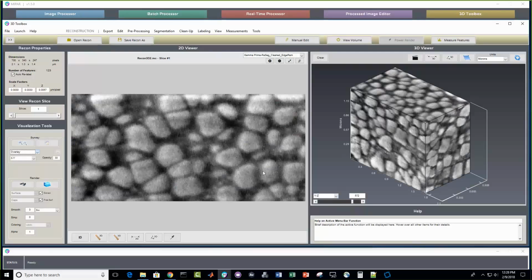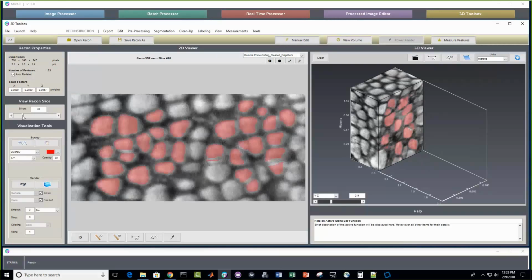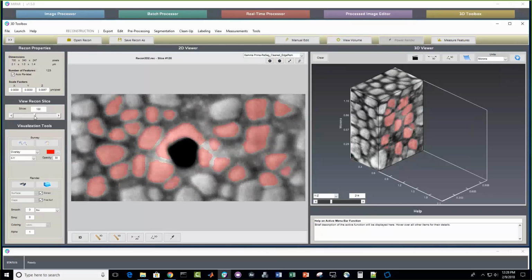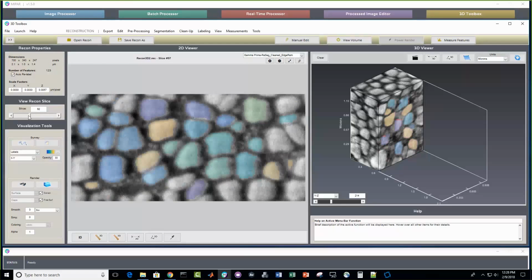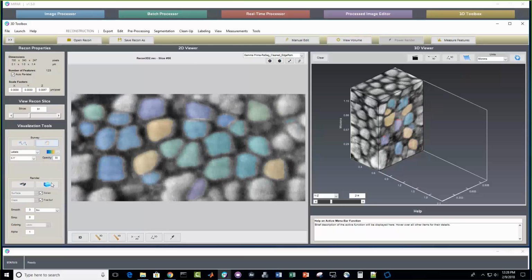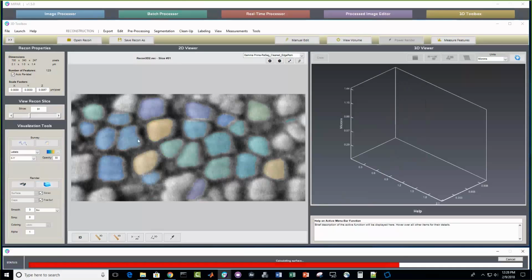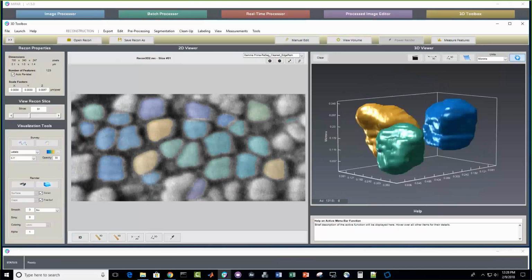Turn on the segmentation, and you can see the fully selected particles that we have. Go to Labels, View, to see the individual particles colored separately. And then you can do some nice quick visualizations of things. So we can pick these 3 particles with our render tool and say go, and now we'll get 3-dimensional visualizations of those 3 objects here.